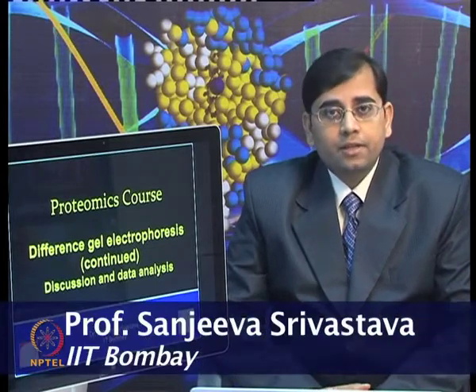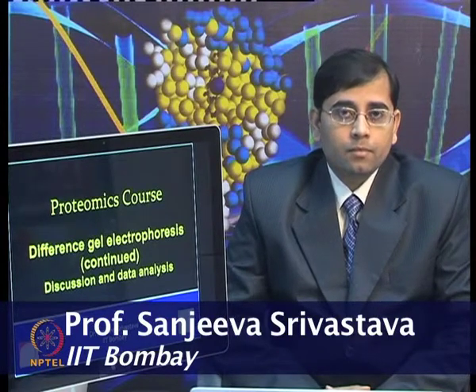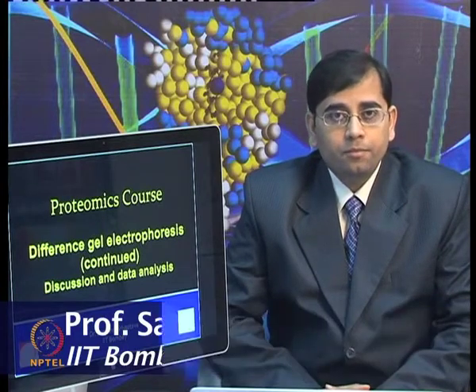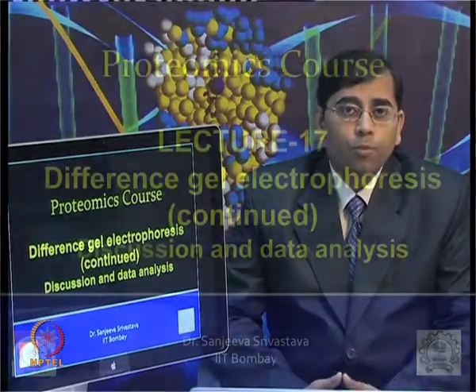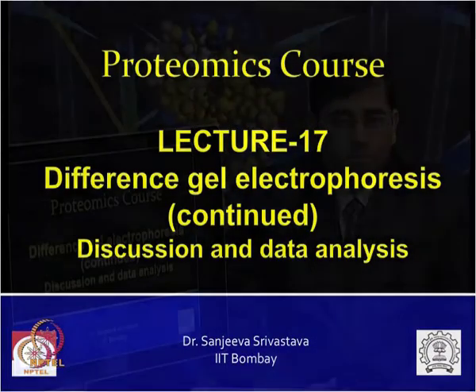In the last few lectures, we have discussed gel-based proteomic techniques. You have seen how two-dimensional electrophoresis can be performed. There are certain limitations of this technology, so new, more advanced methods have emerged to overcome those challenges.